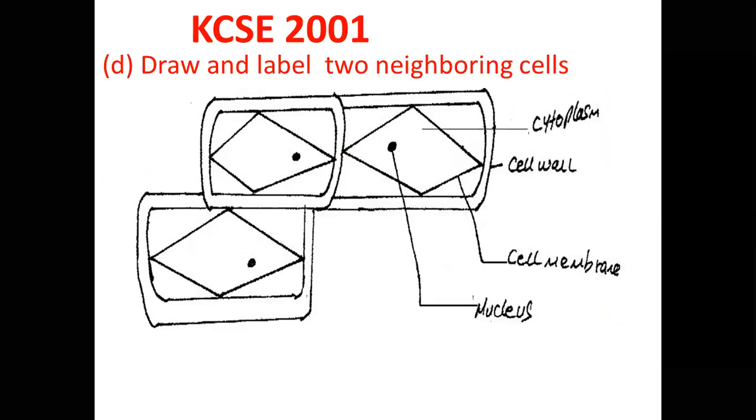You can see outside here, this is the cell wall.